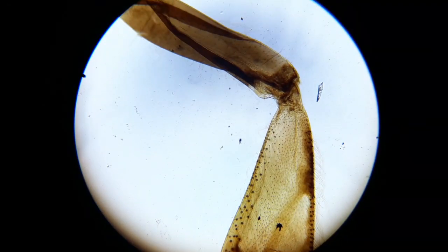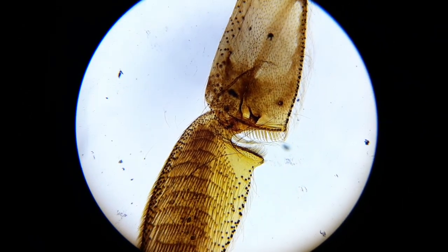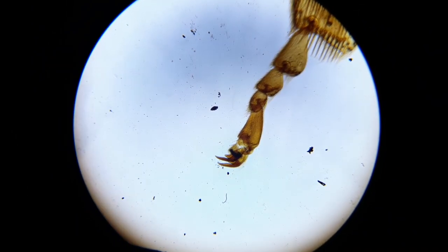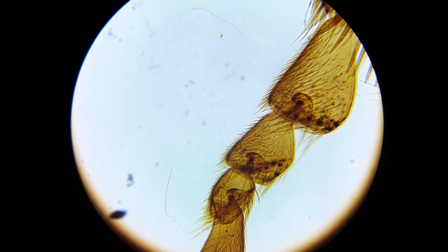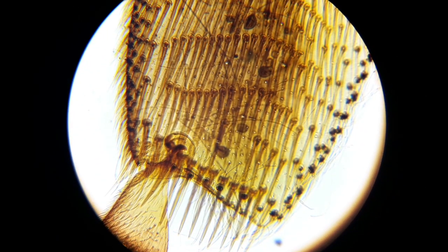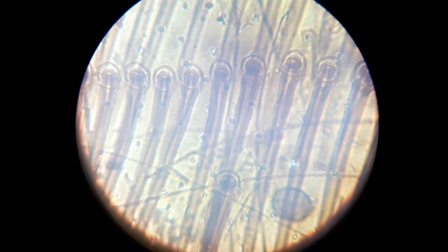Yeah, this is the fly's leg that you can see now. Also, I'm using the 4x objective, the low power objective. The fly leg is pretty large, and for this reason, it covers already quite a lot. This is the claw. This is now the 10x objective. The claw becomes bigger. Of course, you can see the hair quite well. And later on, I also switched over to the high magnification 40 times. So you can see here, this is now in 40 times.